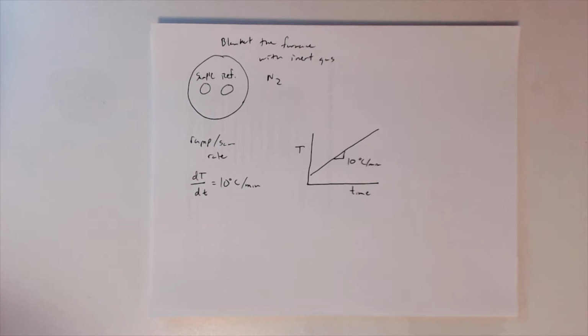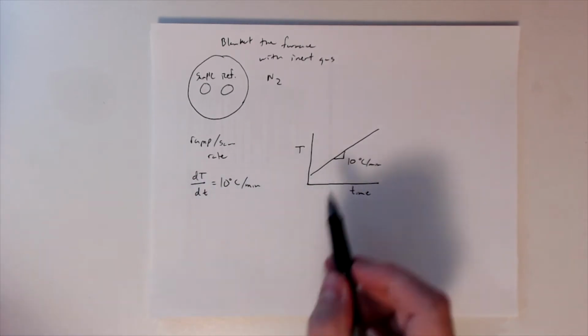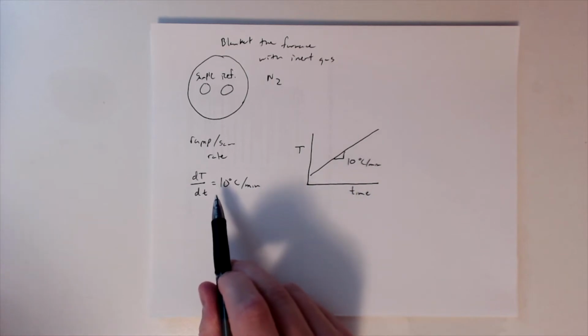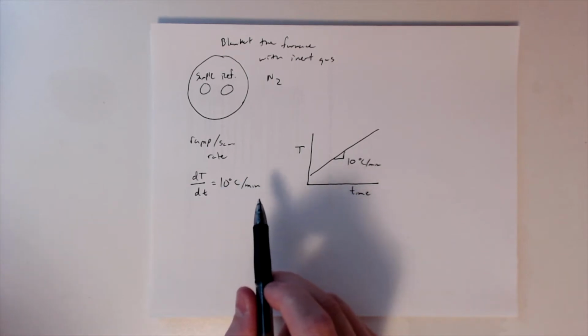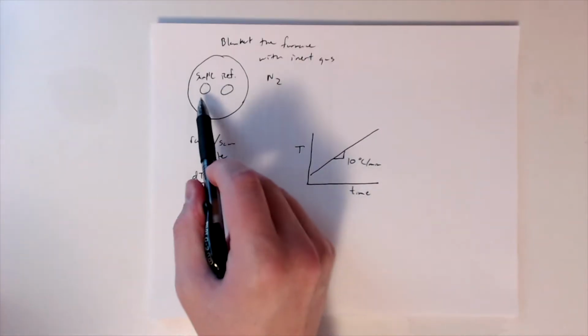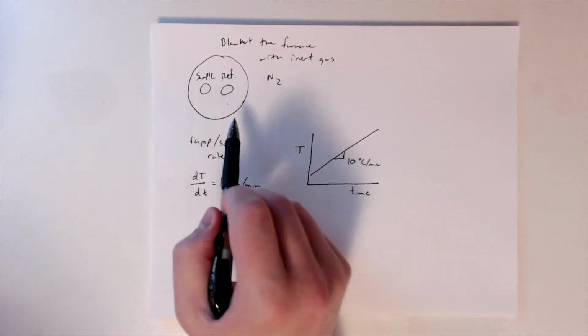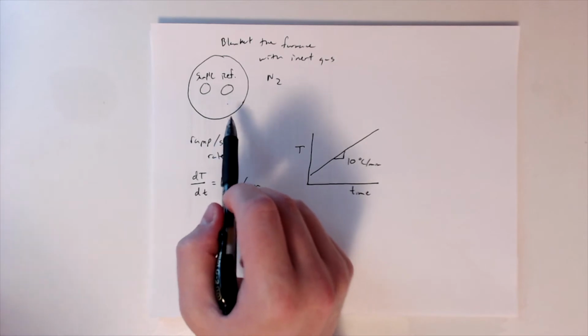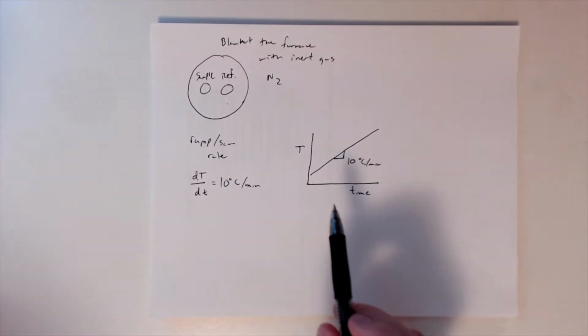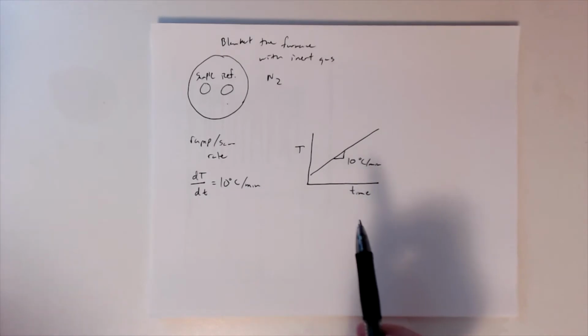So that's the first part that we have, and this is something that we control. We control the ramp rate, we control the temperature that it starts and ends at, and so we have control over this furnace. And again, both of these are ramped in the same way, have the same amount of N2. Everything is treated the same except the power, right?